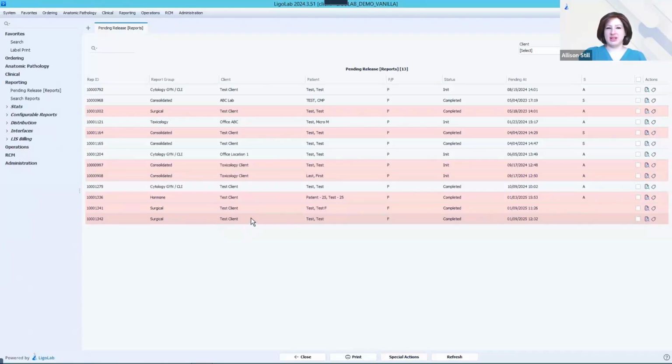be distributed to the client or provider, however you have configured in the application for the client provider. The common distribution options being fax, remote printing, in-house printing, EDI, of course, or an email to log in and view the report on our provider portal. And that is the end of the life cycle of this case for us today.